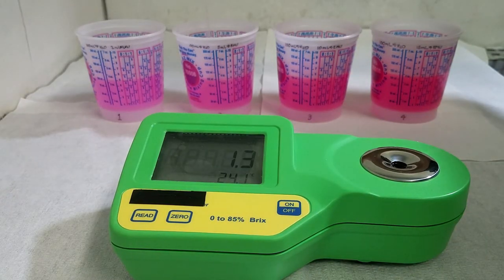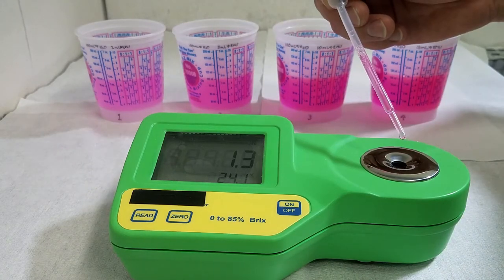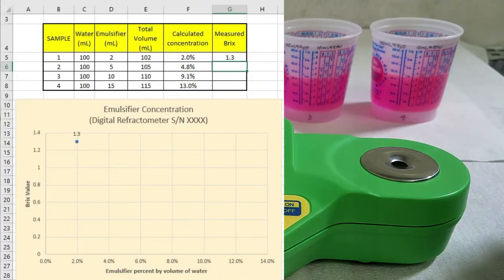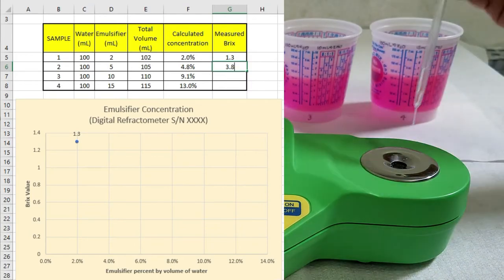Remember to clean the pipette and the window sample. Taking the second sample, we are going to get the second measurement which is 3.8. So we have the second chart point.